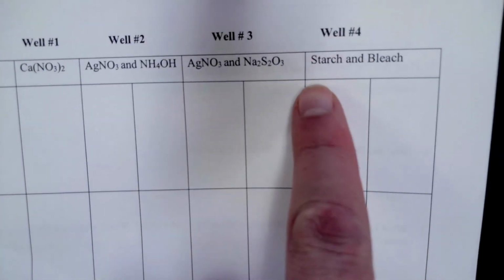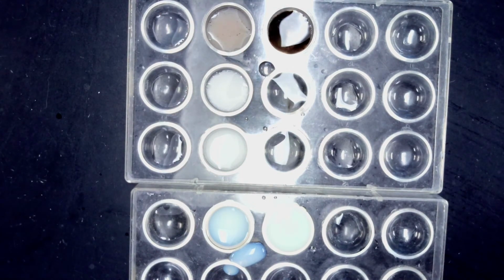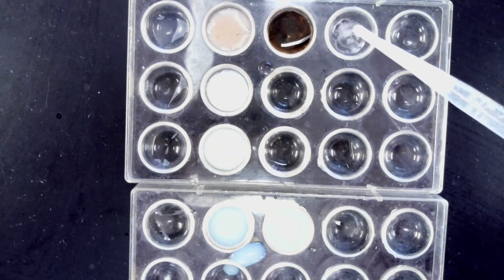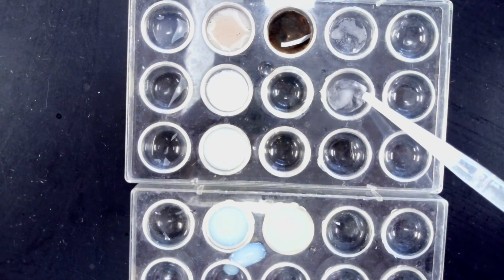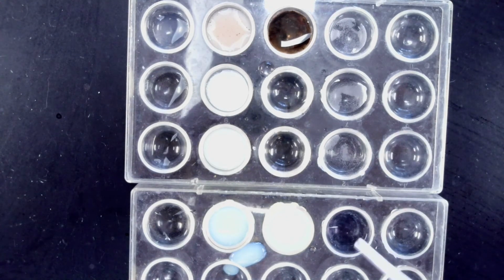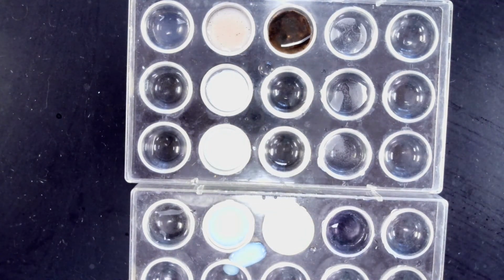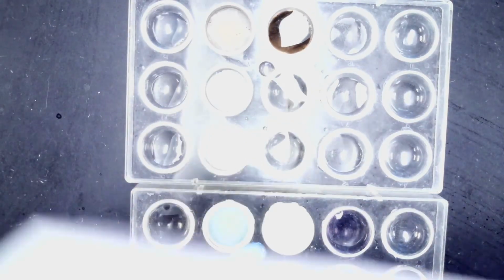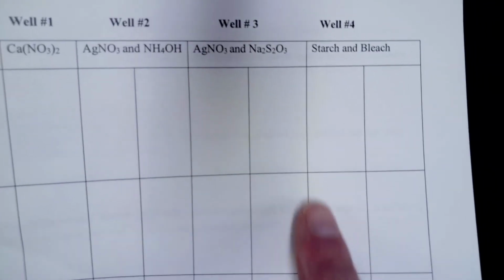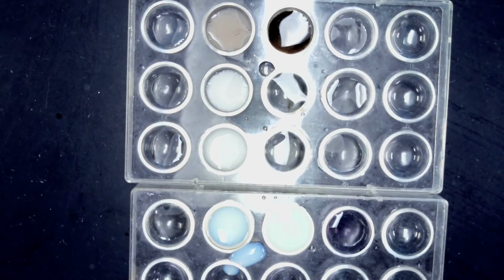Okay, now we're on well 4, so we're going to add starch. And now it looks like something's forming there, but that's really just kind of fizzy bubbles from when I mixed up the starch. You can see after it sits, it just kind of mellows out, so nothing happened there. And then we're going to add the bleach. So we just did the starch, now we're doing the bleach, so make sure you're recording them in the right spot.